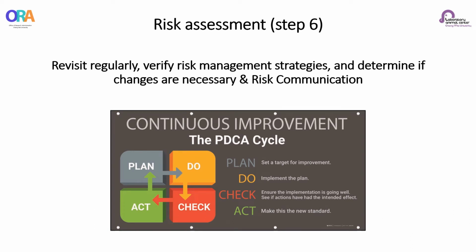Step 6, continue the risk management cycle and adjust and adapt as the need arises. These include a regular update of the biosafety manual and SOPs when changes in procedure or equipment occur.